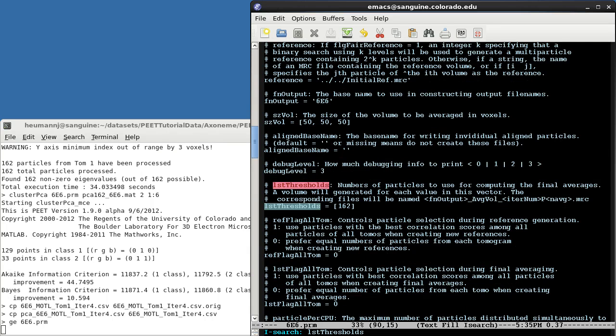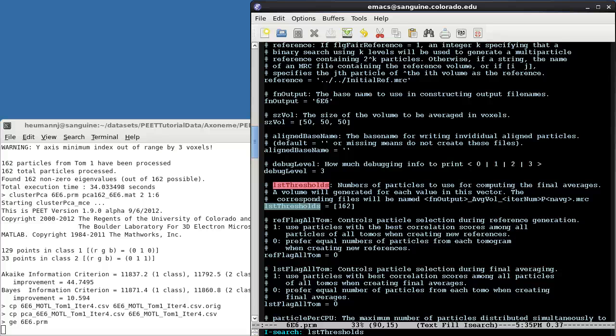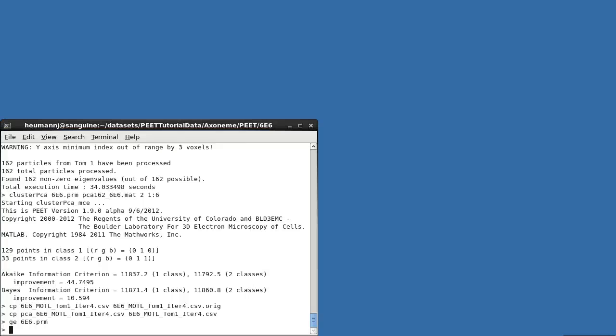For creating class averages, frequently you'll only want a single average, rather than averages with various numbers of particles. You'll also need to be careful that your class average doesn't override an average from the previous alignment. You may need to rename or move the previous averages to avoid this. In this specific case, ListThresholds already specifies a single average using all available particles, and since we know that neither class contains as many particles as the original average, there's no need to do anything special. To generate the class average, I can manually invoke averageAll, specifying that I'm only interested in generating the average, and not the reference, from the final iteration, which was iteration 3.